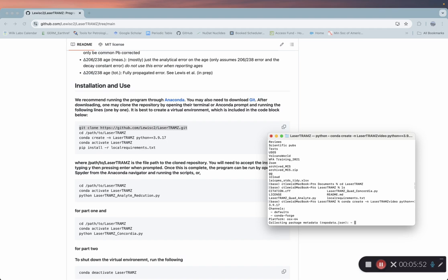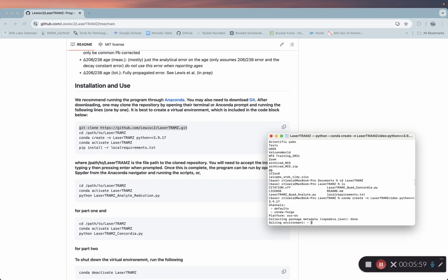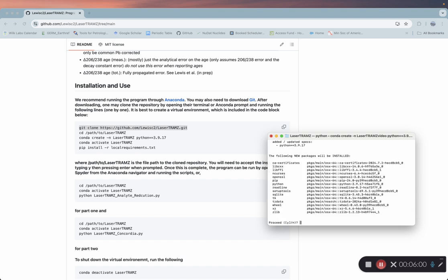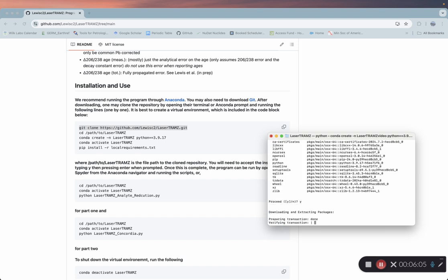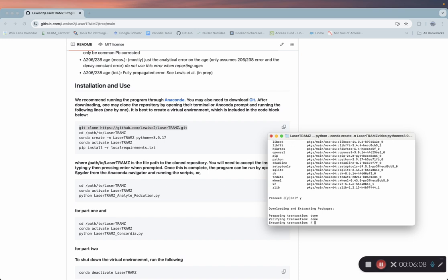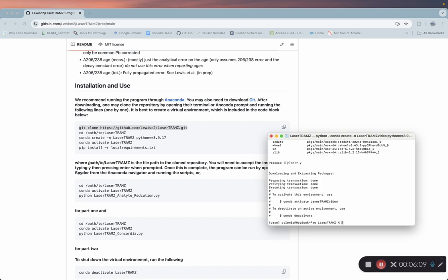So that will install. Hopefully I can speed up this video. When you get to this point, go ahead and type Y, enter. Great.